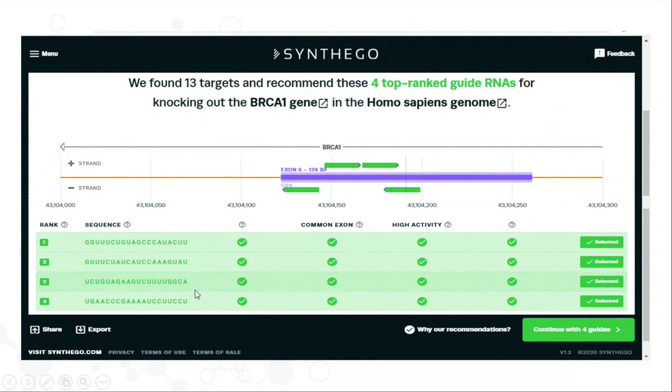Now here you see you have got U. This is basically for when you want to order from their site only. If you're ordering from their site, you just click on this one, select it here, and order it. But if you have to order from any other site or vendor, then whatever is their recommendation, according to that, you use the sequence.